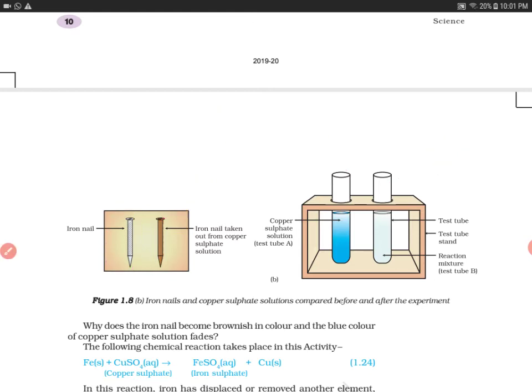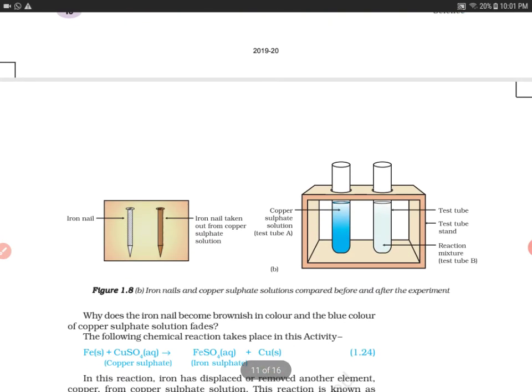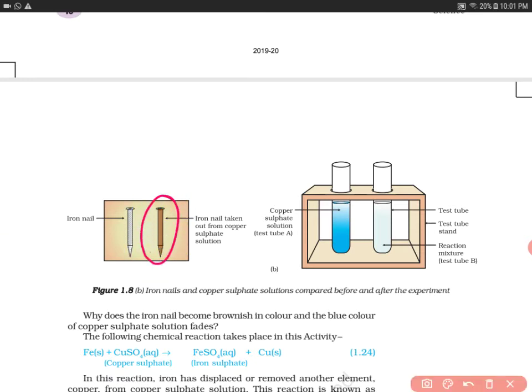Referring to figure 1.8A, we can see two iron nails. When we remove the iron nail from the copper sulfate solution, we will see that the iron nail is brownish in color.